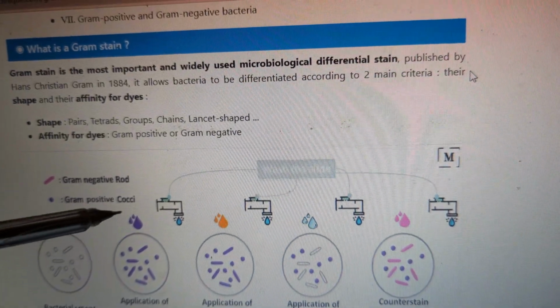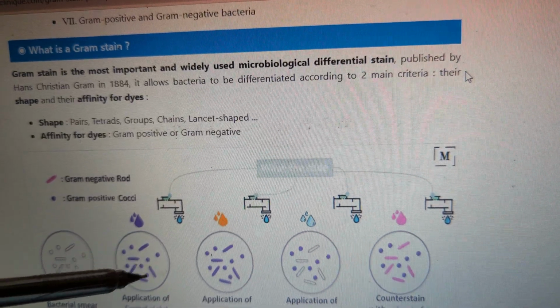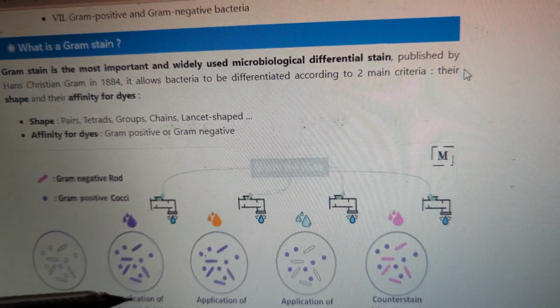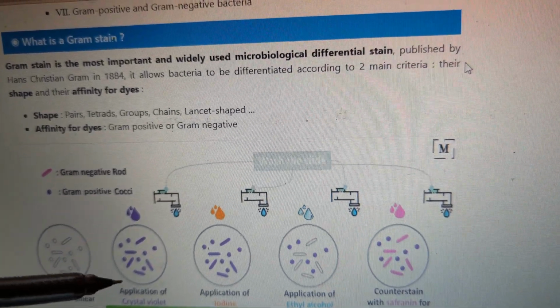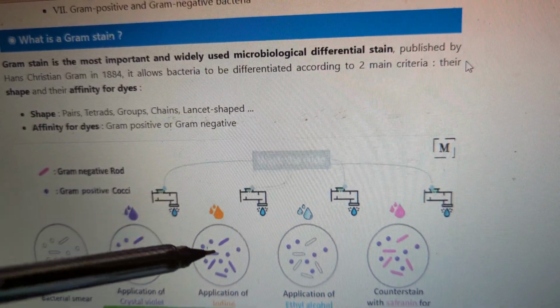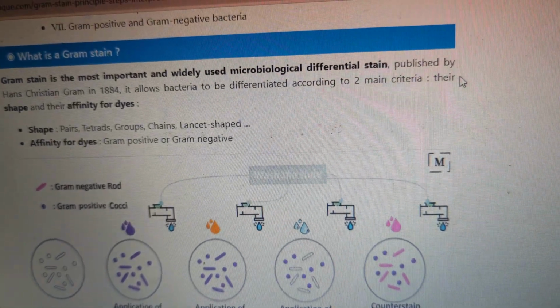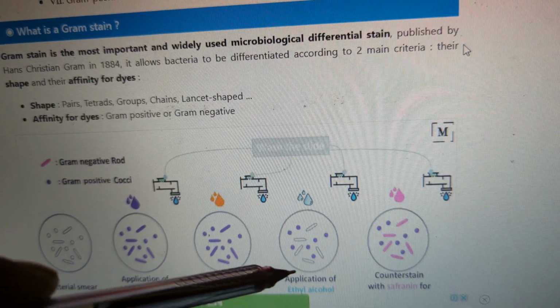Okay, you can even see a nice purple in my screen there. So we have that applied, and then of course rinsed after a few minutes, or is it a minute? Your manual shows the exact time there. So you rinse it off after the specified time, and then we apply the mordant, like I said, in between the primary stain and the decolorizer.